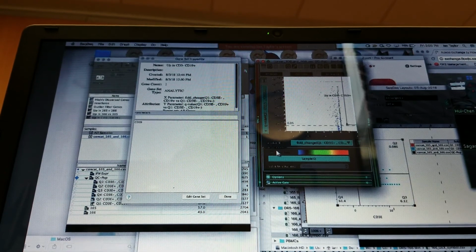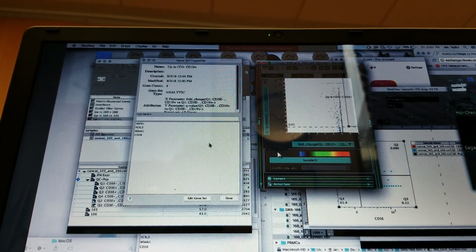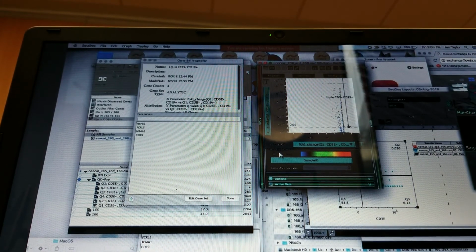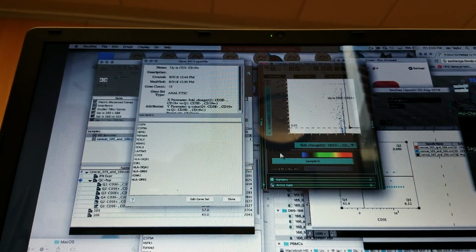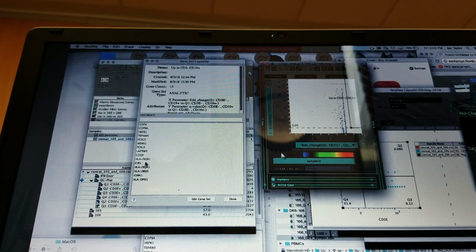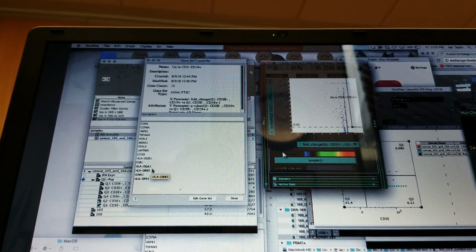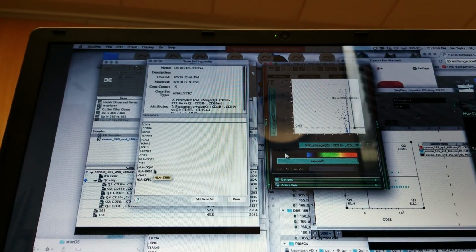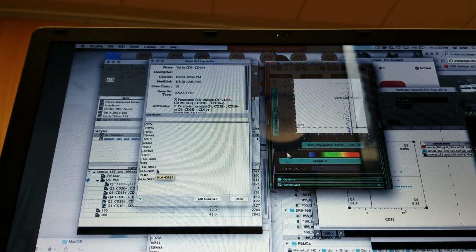So if I make this a little bit wider, it should eventually calculate the rest of the genes that are also upregulated, if I'm being more generous in terms of my fold change cutoff. Right. Well, that's interesting too. And then we start to see HLAs come in there, which we might expect for B cells, right? Okay. Yeah, that's kind of interesting. So those are the ones.